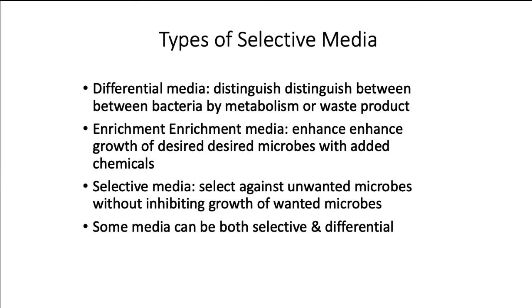Then you have selective media. This is very commonly used when you are looking at enterics. Enterics are the ones that are common in the GI system, and they tend to be gram-negatives.